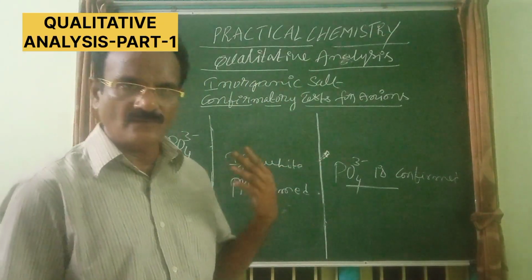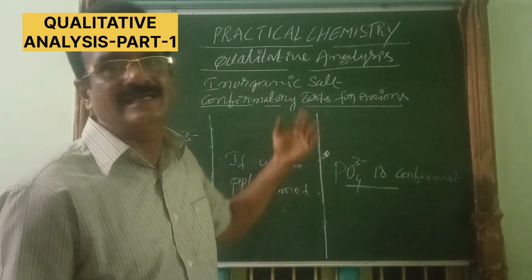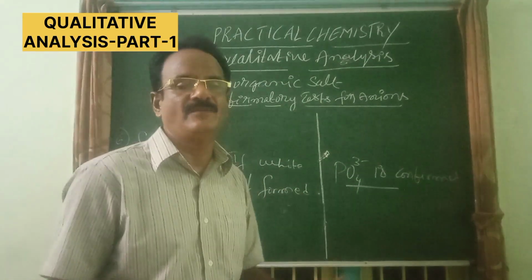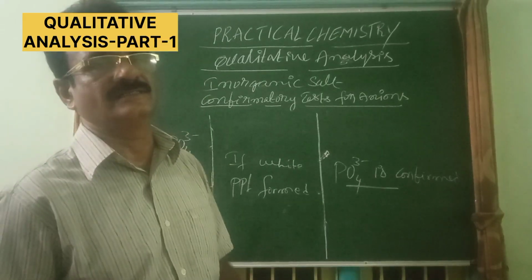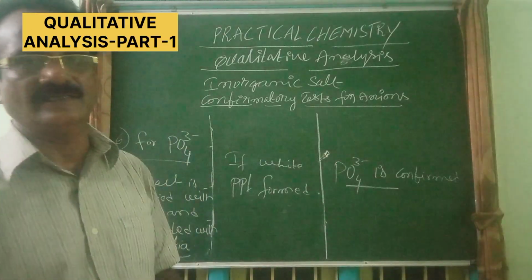If we identified by using this test, then we can use the ammonium molybdate test in confirmatory tests. Okay, this is about confirmatory tests of anions.